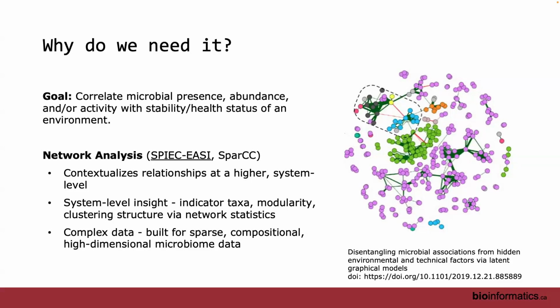Well, you can apply taxonomy to an ASV. So yes, you can overlay taxonomic information onto a network. So during the lab, at the end of it, you're going to take a very simple network and you're going to be able to overlay certain types of information onto that network that is not necessarily part of the calculation of the network, but can give you attributes. So taxonomy, different types of treatments and things like that. You could just color them in. It's actually very, very helpful. That's what you're seeing here, the different colors are different taxa.